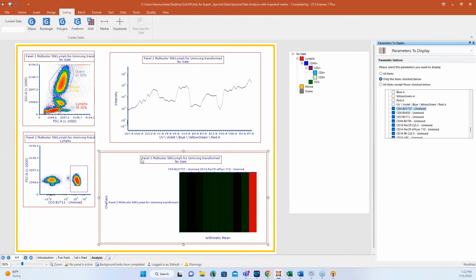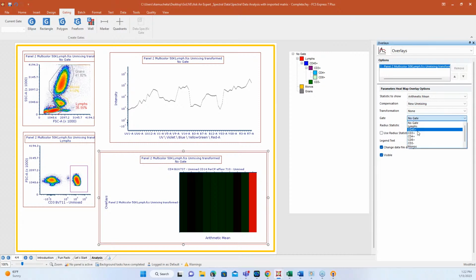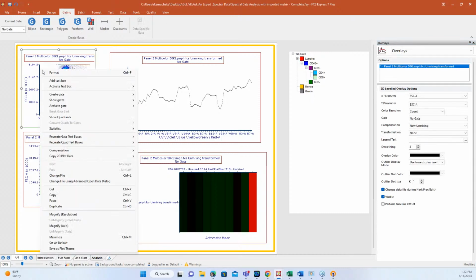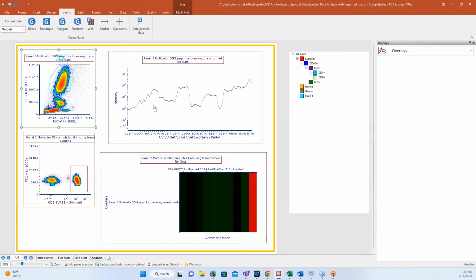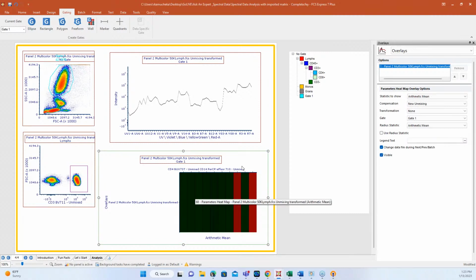If you want to add gates, don't worry, you can always adjust that either in overlays. We can change the gate that's applied. And okay, so it looks like my gates are not applicable. So that's where we're going to start. We're just going to right click, and I'm going to deselect all of these gates and start building backwards and see if I can fix whatever is happening right now. We're going to add this gate. There we go. And then if we add this gate here, we can start seeing differences in our parameters.